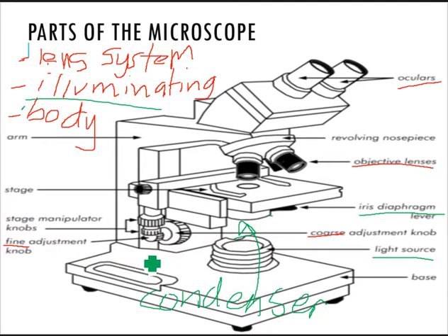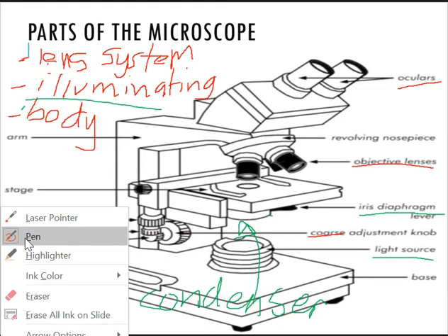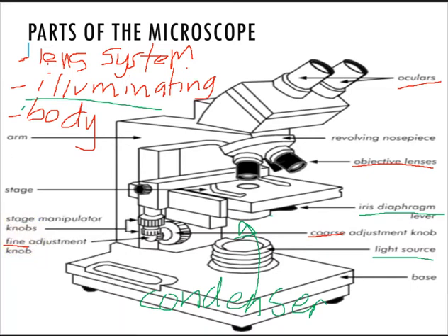Yes, hello, guys. I am back again. A little bit of heartburn there. But basically, your condenser is somewhere here. Okay, so that's it for this slide. We are going to delve deeper into the parts of the microscope in a second.